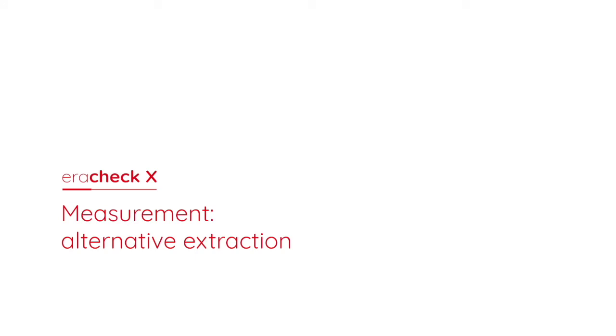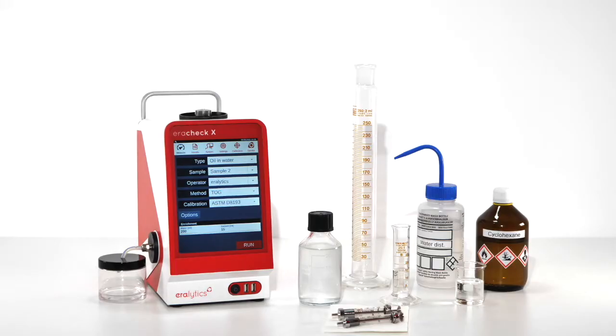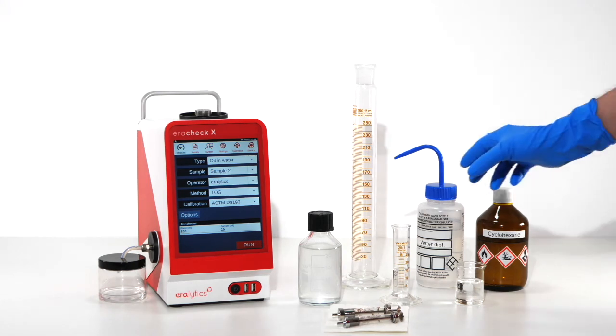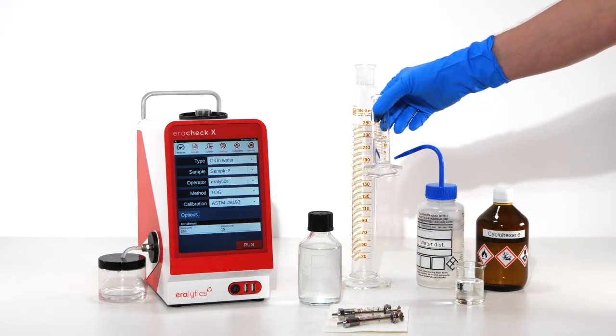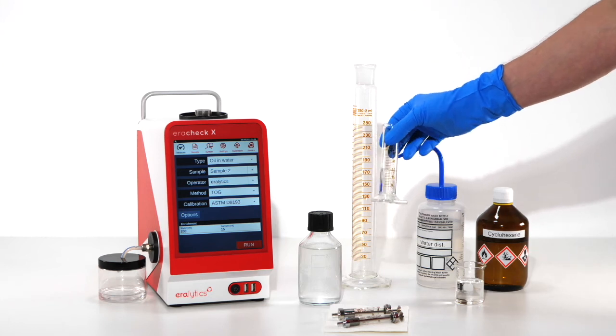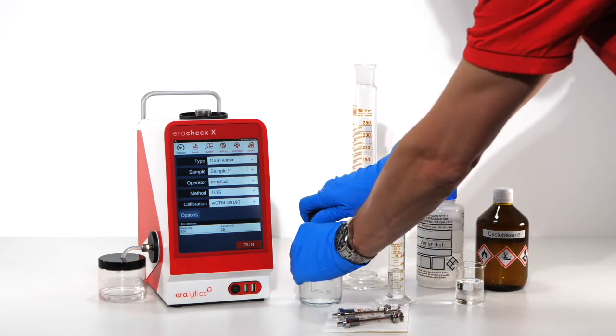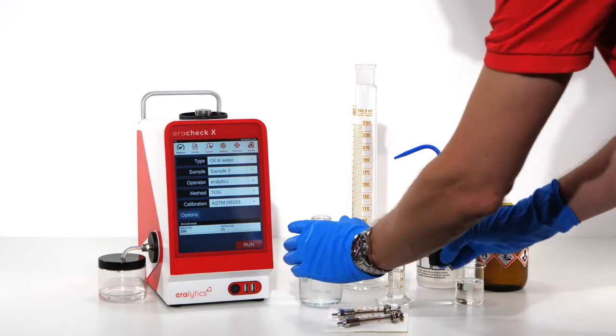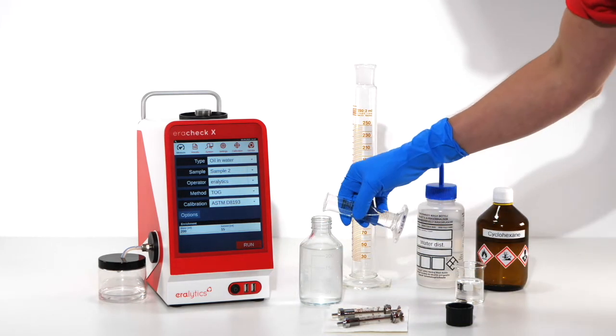Alternative extraction. In case the exact sample volume is unknown, the following procedure can be applied. Prepare 15 ml of fresh cyclohexane in the small graduated cylinder. Pour the cyclohexane into the sample bottle. Close it.